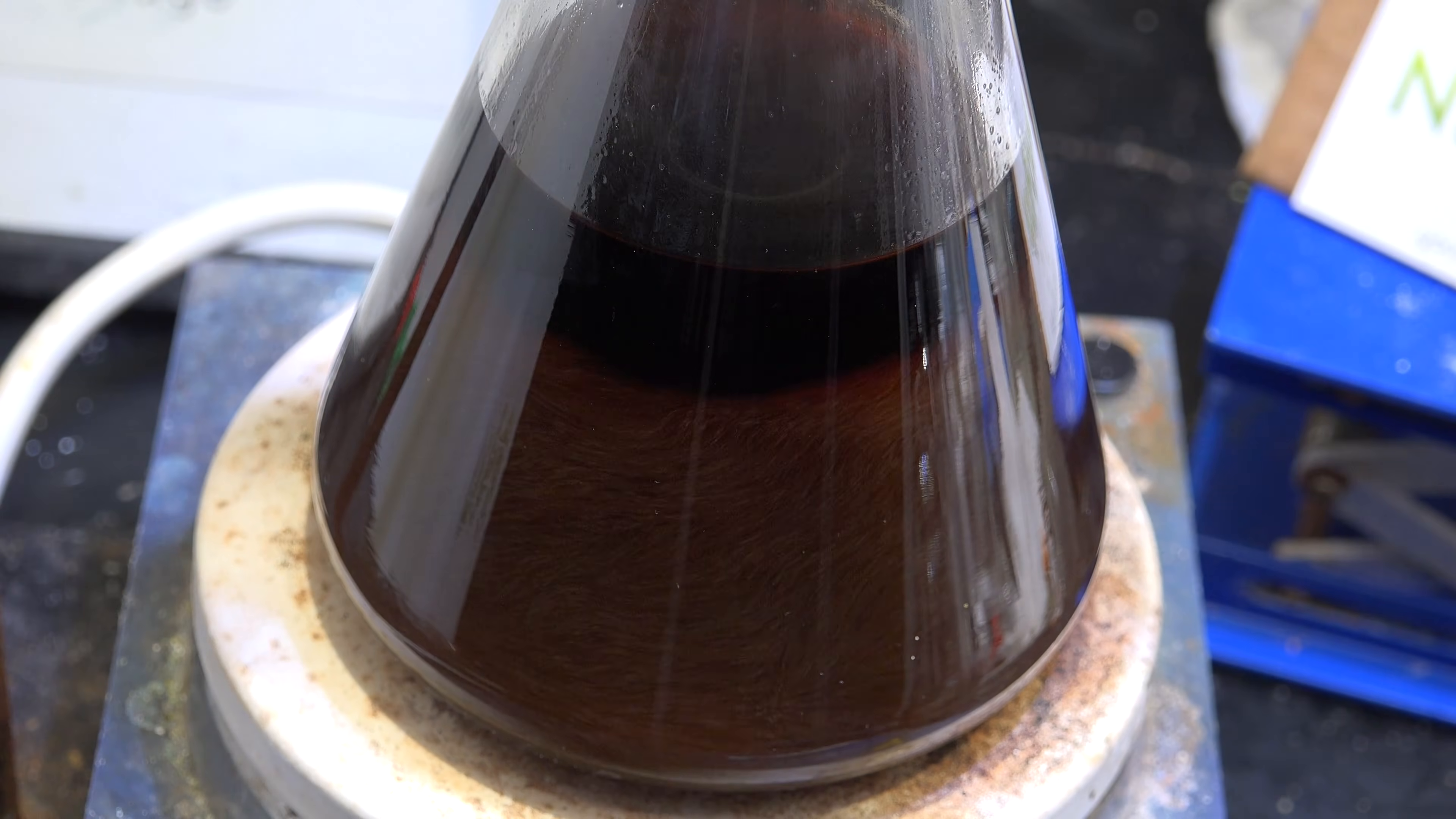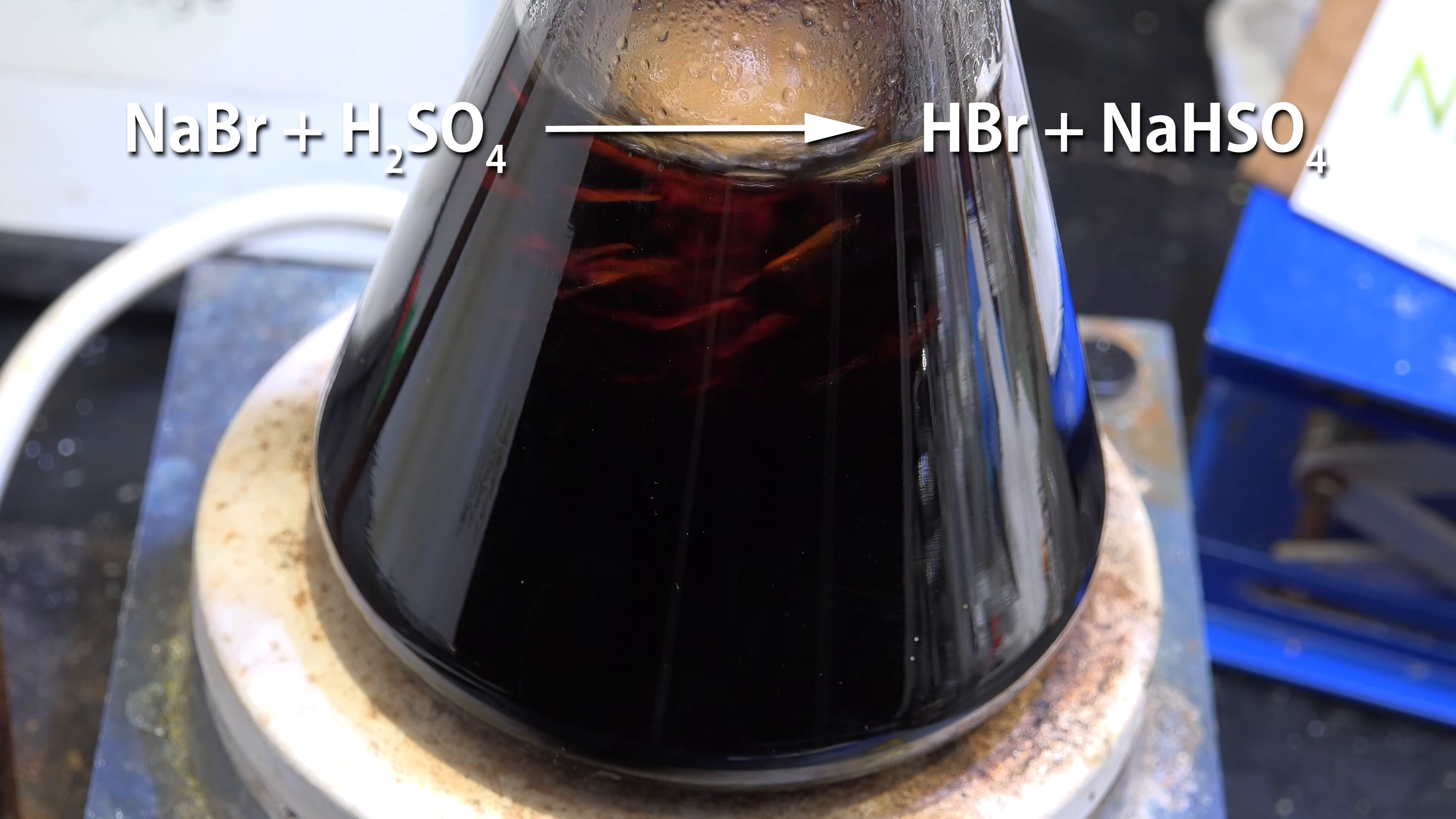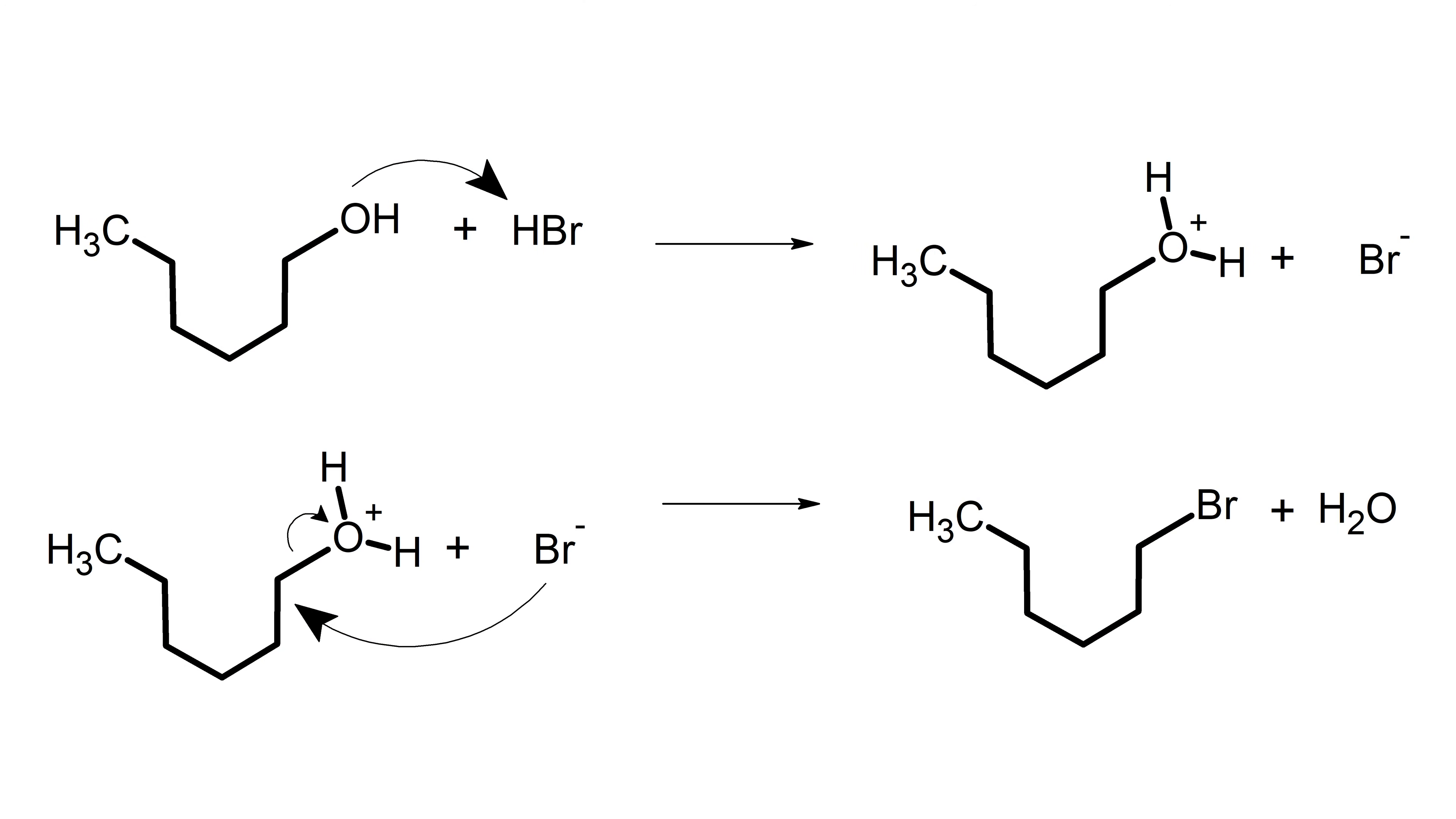With the cooling water turned on we turn on heating and stirring and gently reflux the mixture for 6 hours. What's happening is first the sodium bromide reacts with the sulfuric acid to produce hydrobromic acid and sodium bisulfate. Then the mechanism proceeds similarly to bromoethane. The alcohol group in the hexanol is protonated by the acidic conditions and bromide comes in and attacks the carbon, forming water and bromohexane.